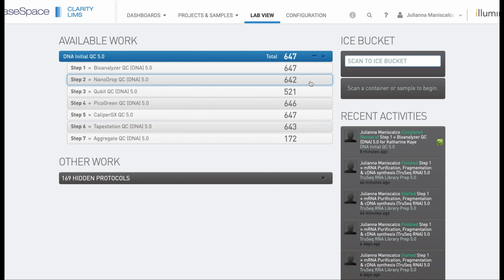specific sample. Again, this does take some manipulation to ensure that it is the right logic for your lab, but it is a very handy tool in order to add some logic to a QC protocol.